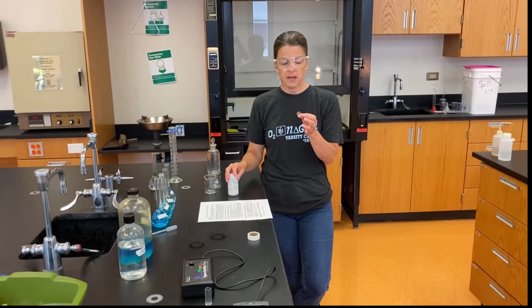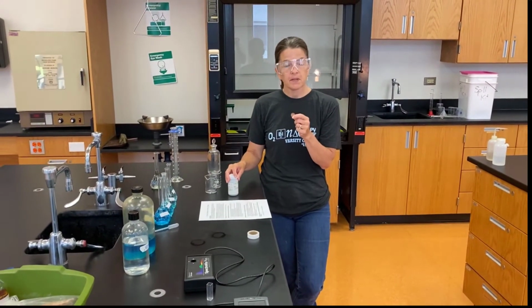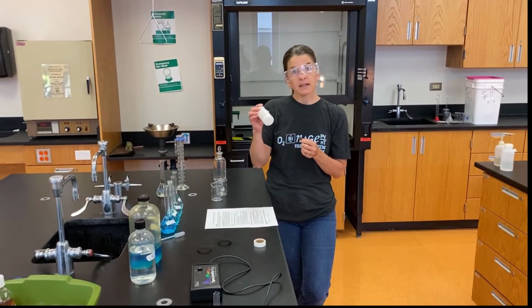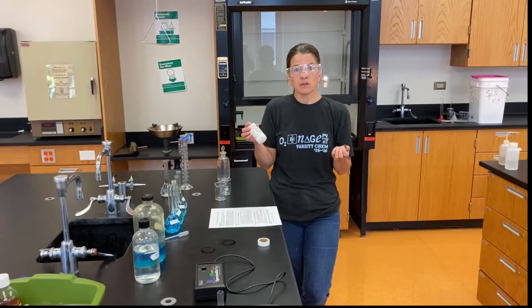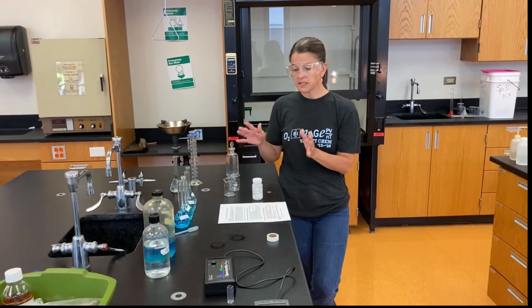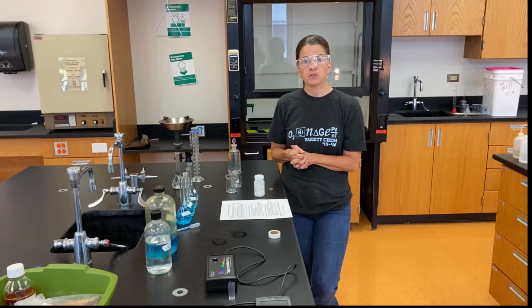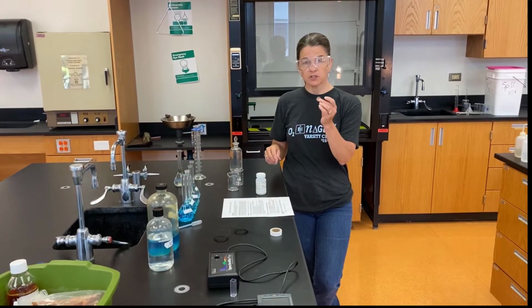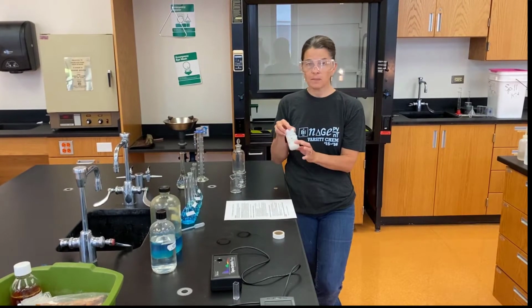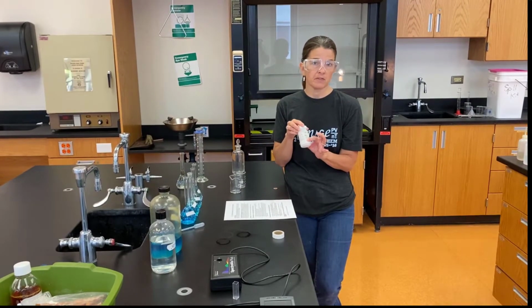Pennies are in fact made of both copper and zinc. There are lots of different ways to combine copper and zinc into a mixture. Brass is actually the same kind of mixture, also made of copper and zinc. So your goal in this lab today is going to be to determine what percentage of our penny is actually made of copper, and also what percentage of our brass is actually made of copper.